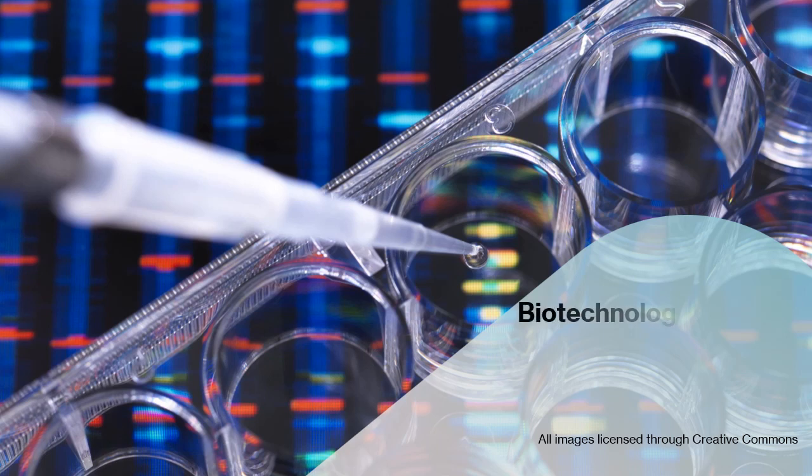Hi everyone. In this video, we're going to look at some of the techniques for cloning genes and how we can analyze those clones with PCR and electrophoresis.